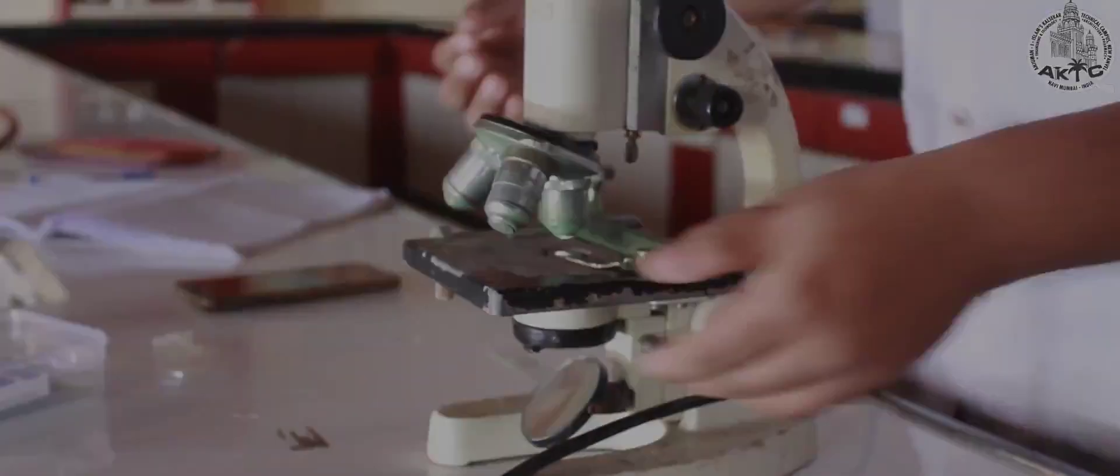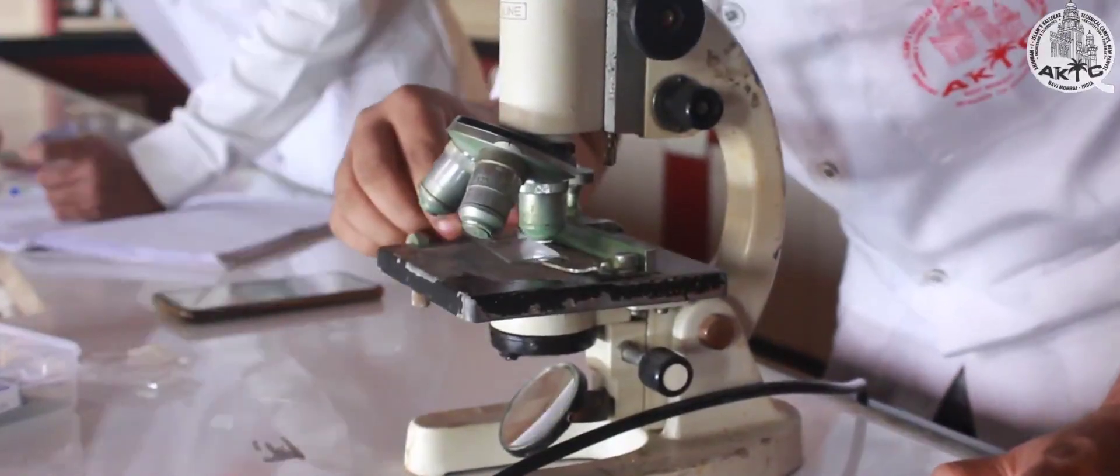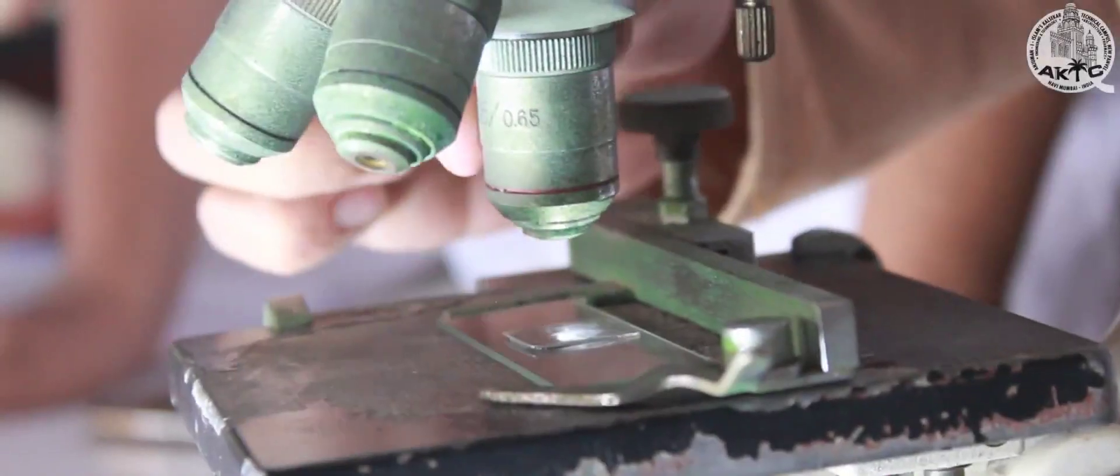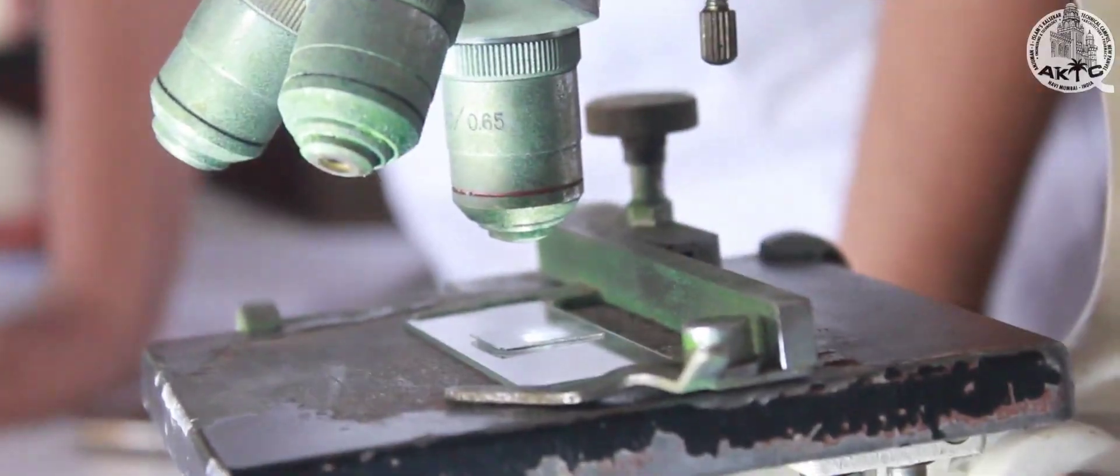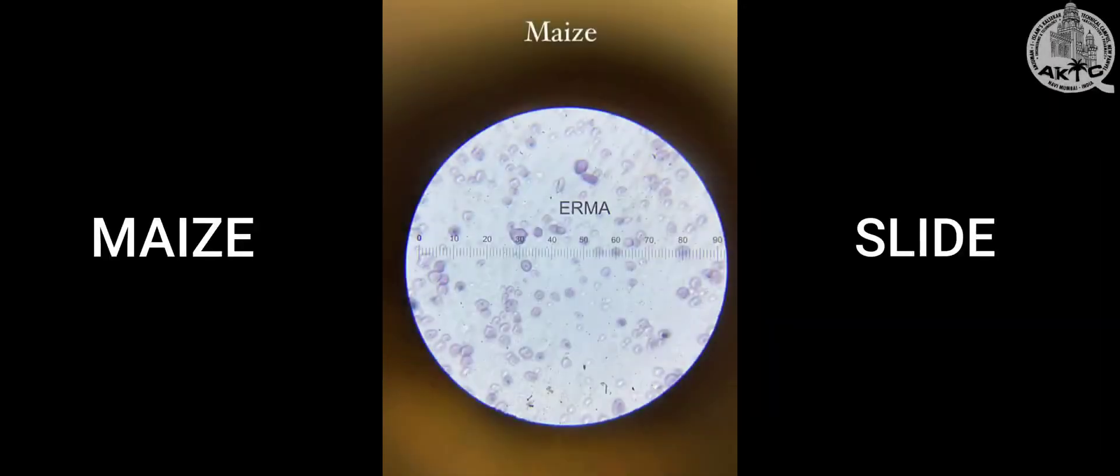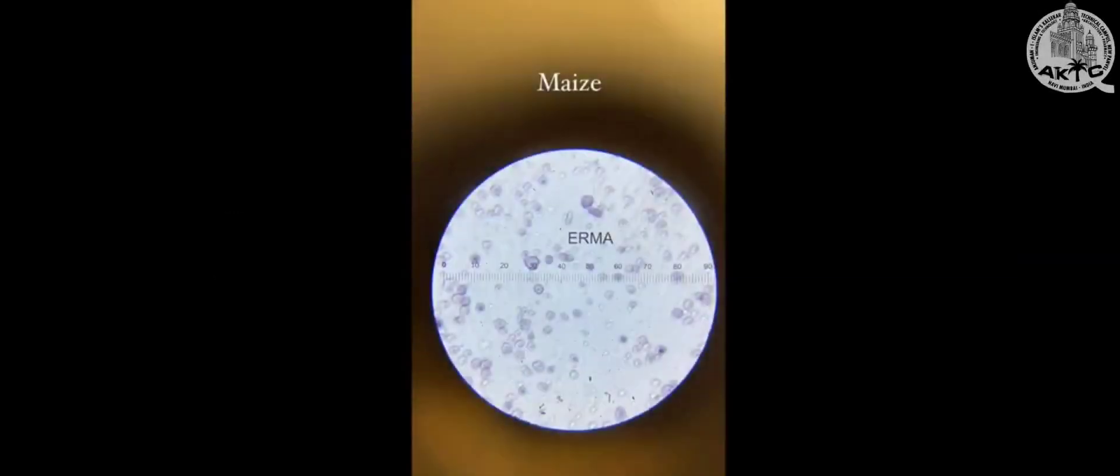Observe under microscope using 10x objective and then later adjust it to 45x. Let's begin with the calculation. This is a slide of maize. Now first we have to check for starch grain and calculate according to its shape.